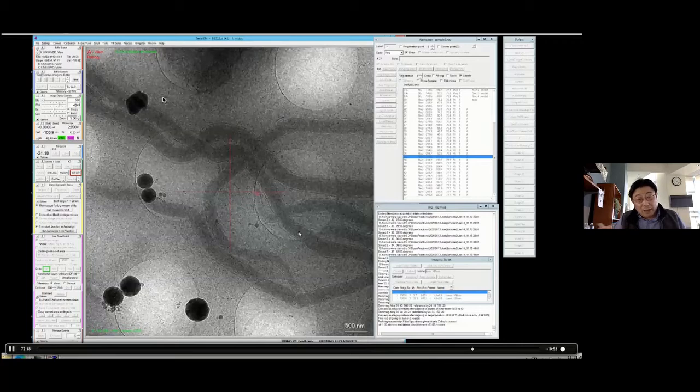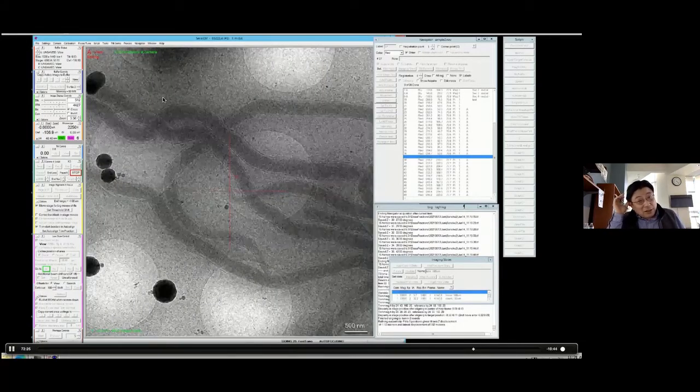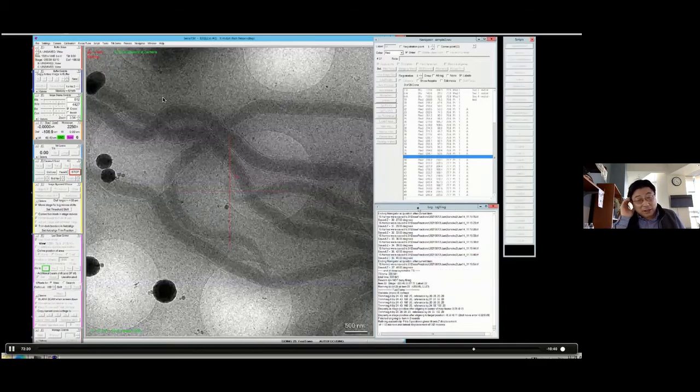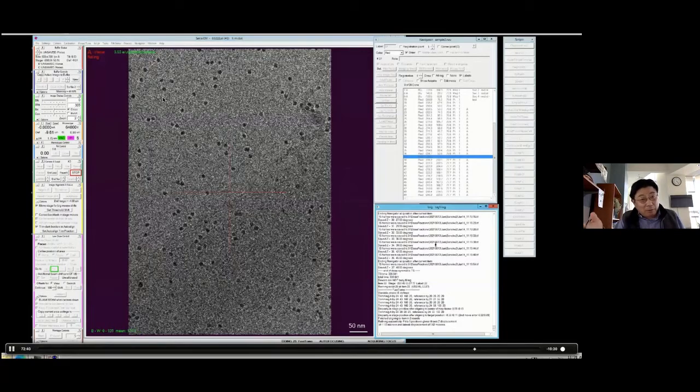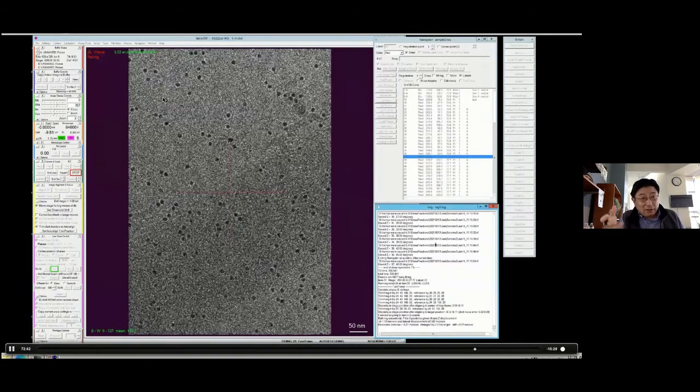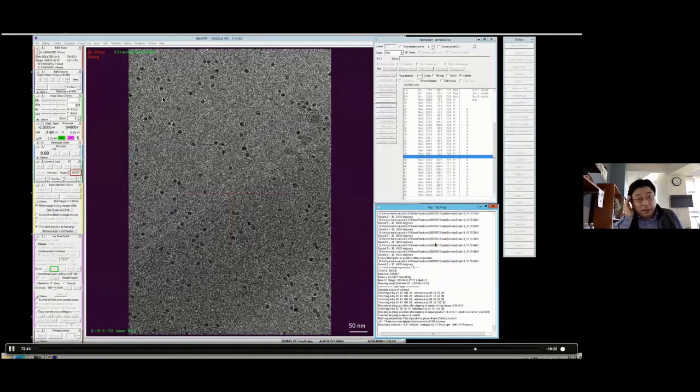This is kind of unrelated, but it's like you go to a junkyard. This is a junkyard: EM grids with so many different targets. You get lost, so you need to be selective and find the best things you can find. Even with the worst sample, you may find some of the best results if you pay attention.